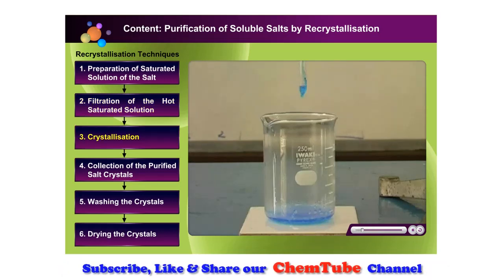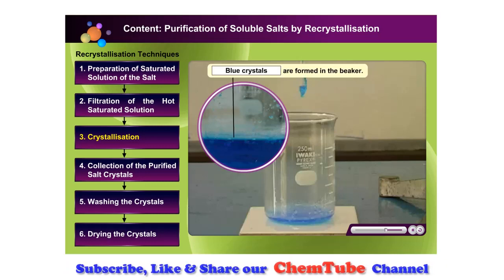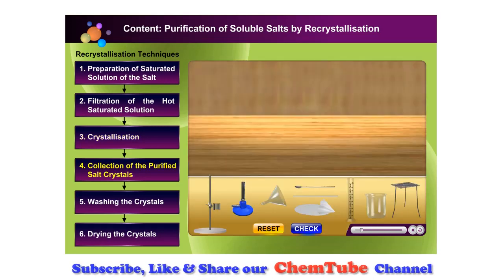The concentrated solution is left to cool at room temperature. What do you observe from the saturated solution? Blue crystals are formed at the edge of the beaker. Crystals of the pure salt are formed when the saturated solution is cooled.